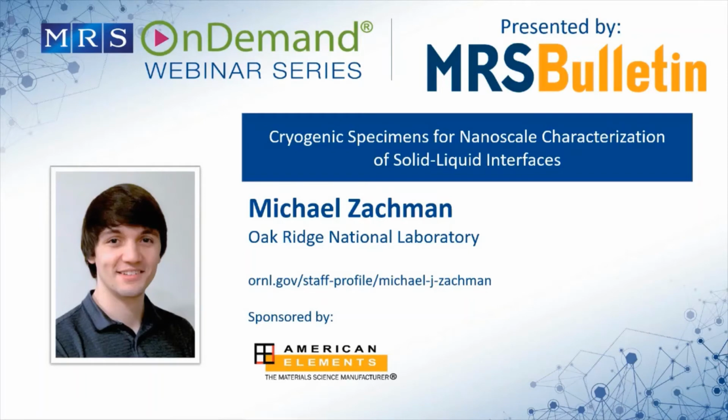So for example, the liquids that they used were carbonate electrolytes, and they tended to damage around 100 electrons per square angstrom or so, or even below that. But what we found was that there were different damage mechanisms that occurred at different doses. At that very low dose, you would start to get some very small bubbles that were probably hydrogen coming off of the molecule.